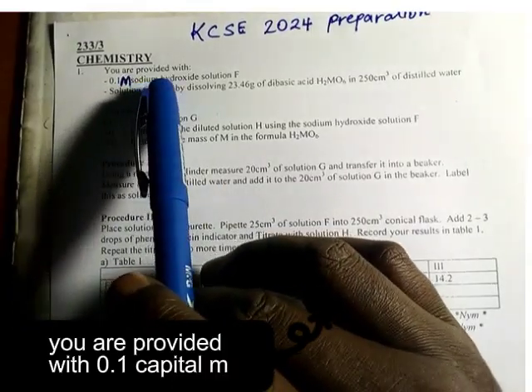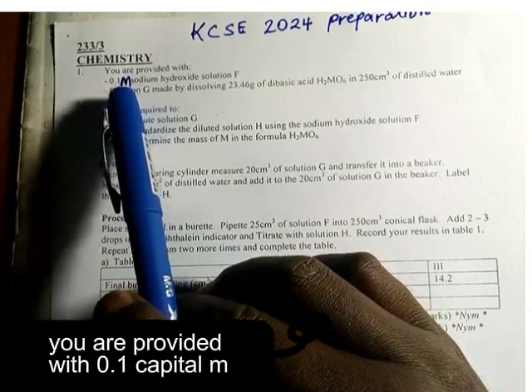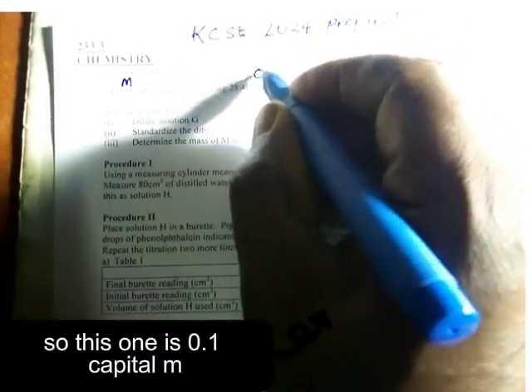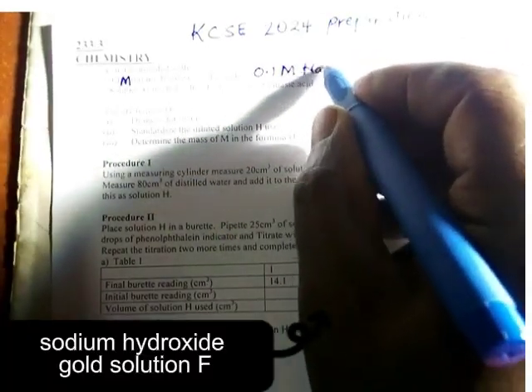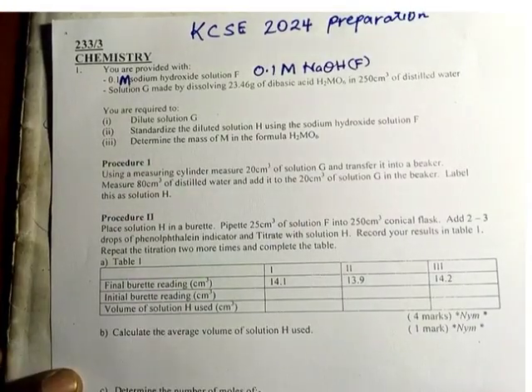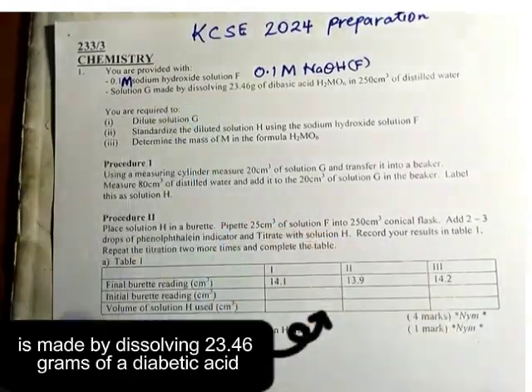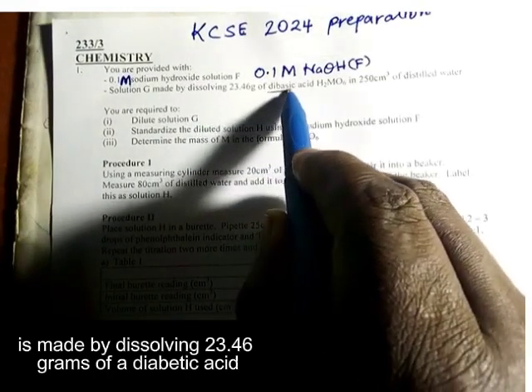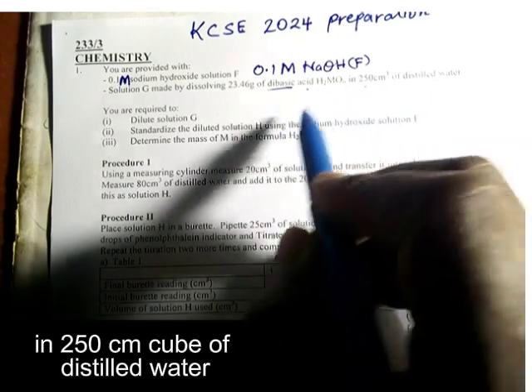You are provided with 0.1 capital M sodium hydroxide solution, called solution F. Solution G is made by dissolving 23.46 grams of a dibasic acid in 250 centimeters cube of distilled water.